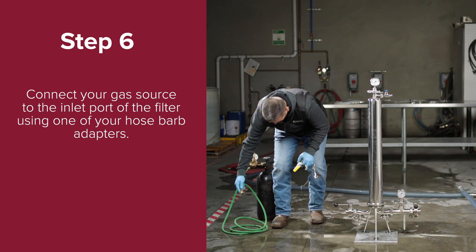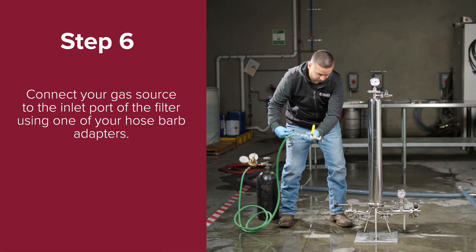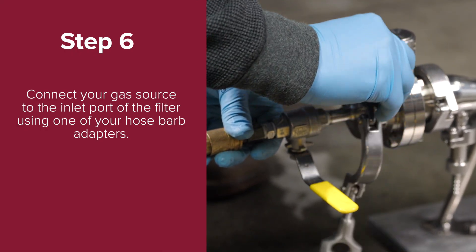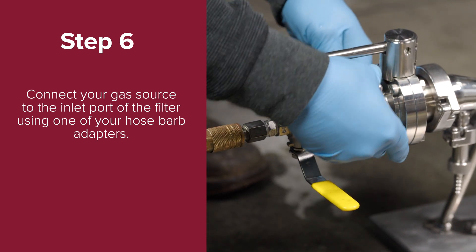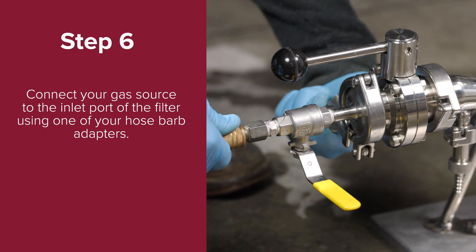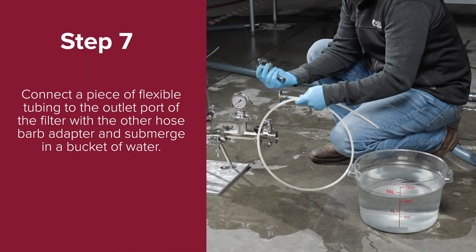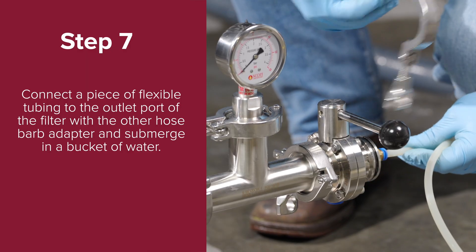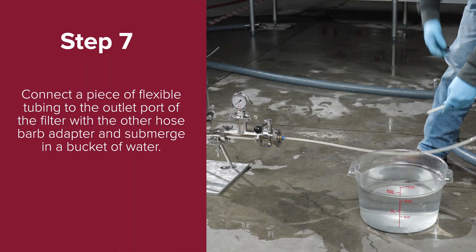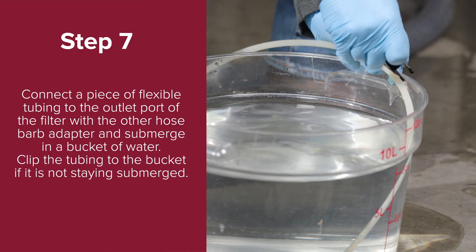Step six: connect your gas source to the inlet port of the filter using one of your hose barb adapters. Step seven: connect a piece of flexible tubing to the outlet port of the filter with the other hose barb adapter and submerge it in a bucket of water. You can clip the tubing to the bucket if it is not staying submerged.